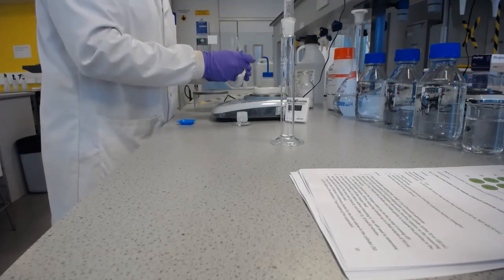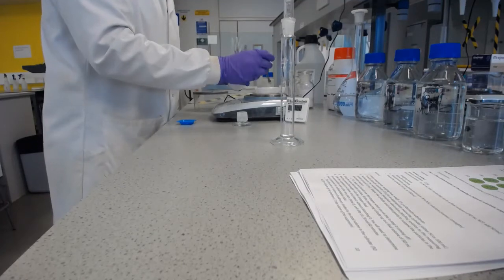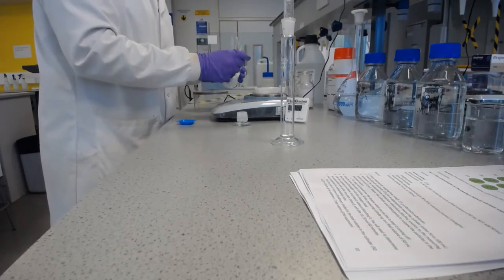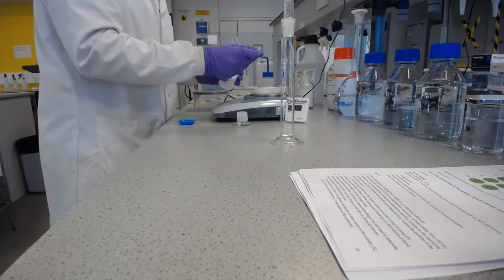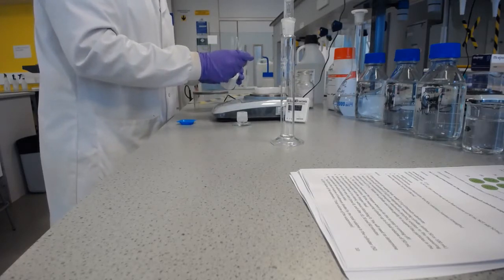Being careful to try not to go over, because if I do, I won't be putting the powder back into this stock bottle. I'll have to put it into a spare weighing boat, and it will go in the solid waste later.